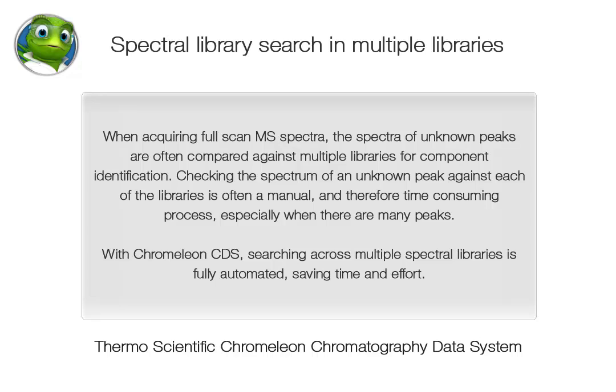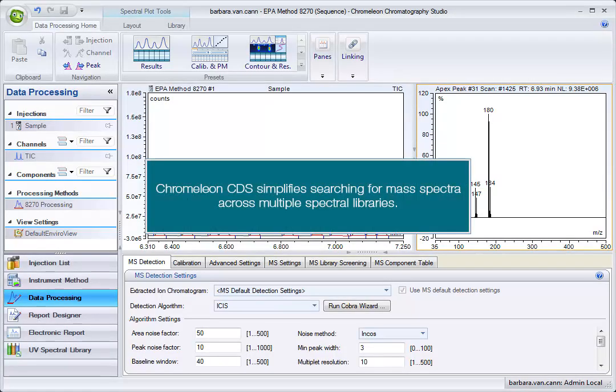With Chromeleon CDS, searching across multiple spectral libraries is fully automated, saving time and effort. Chromeleon CDS simplifies searching for mass spectra across multiple spectral libraries.